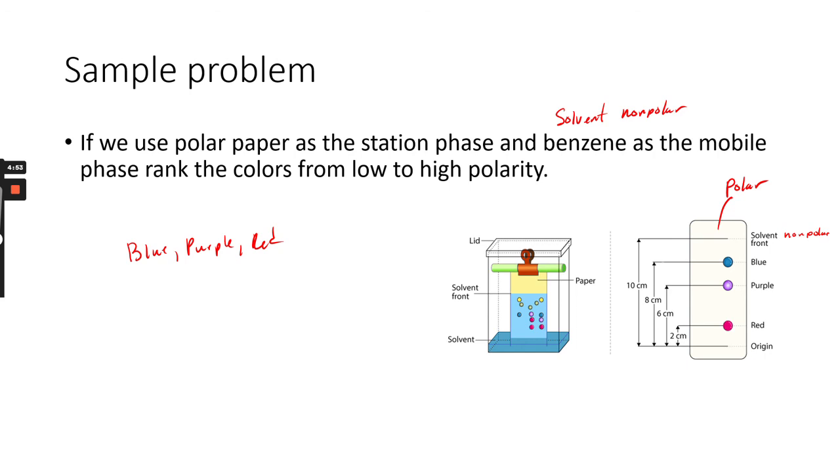And you could actually calculate the RF values for this and rank it that way, but we could just visually see it right here. And that is the end of our special presentation on chromatography.